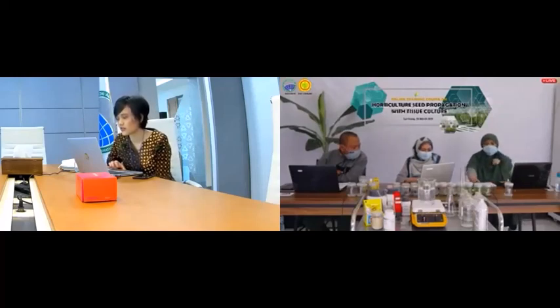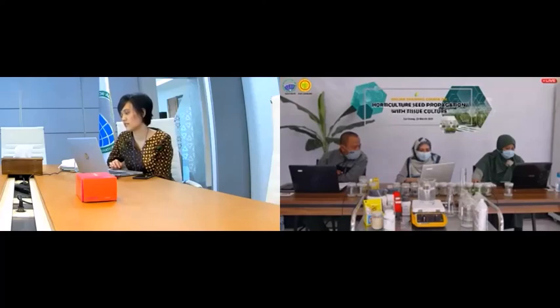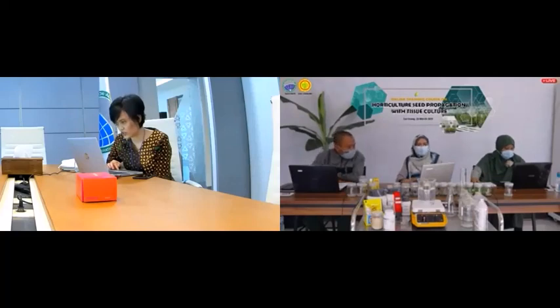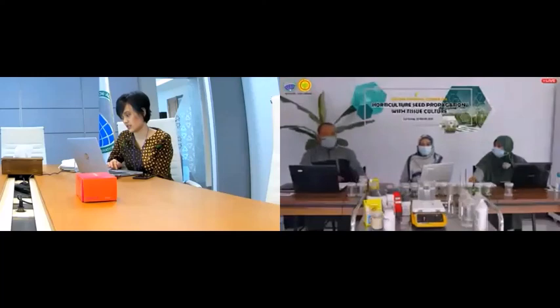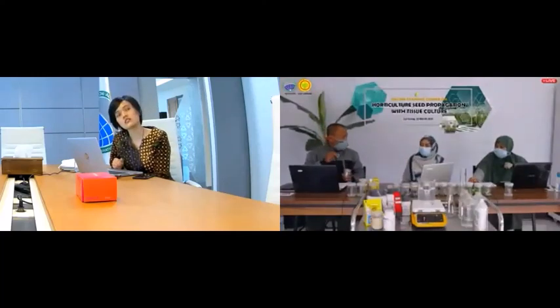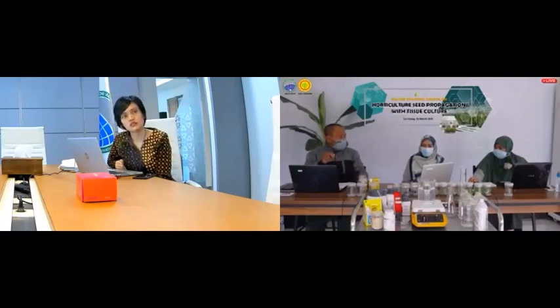Okay, while we are waiting for the participant who raised hand, there's another question from Mr. Walid Kayal: when you treat an explant with iodine, should you wash it with autoclaved water? After you put iodine, you do not need to wash with water.